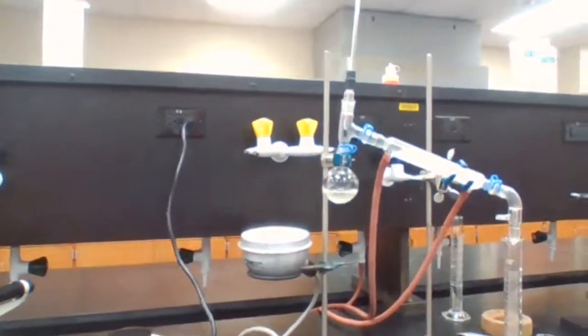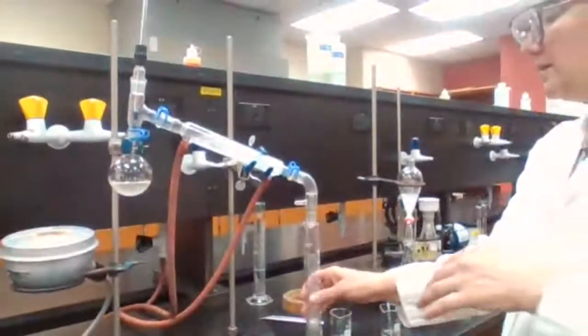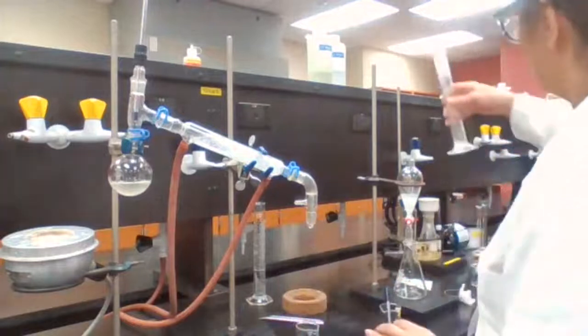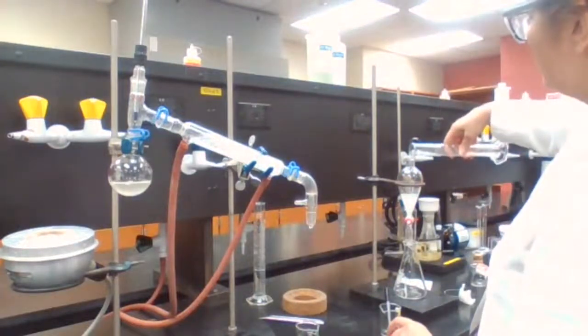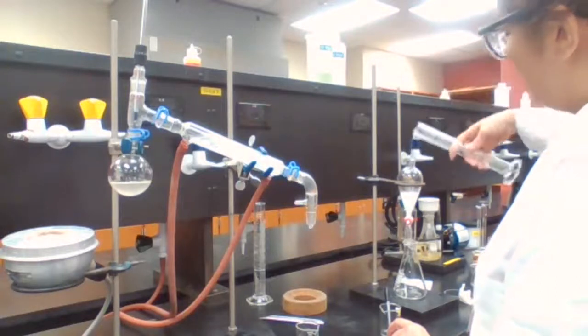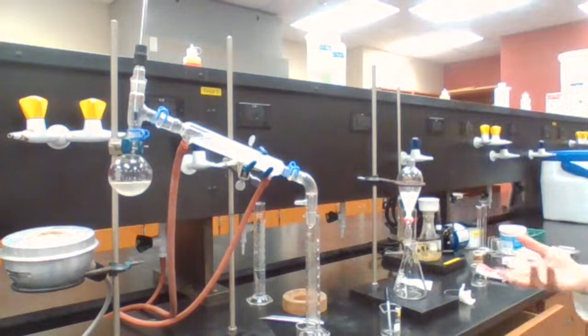We're going to add the remaining recovered solution, or distillate, into the separatory funnel. The two layers have formed.